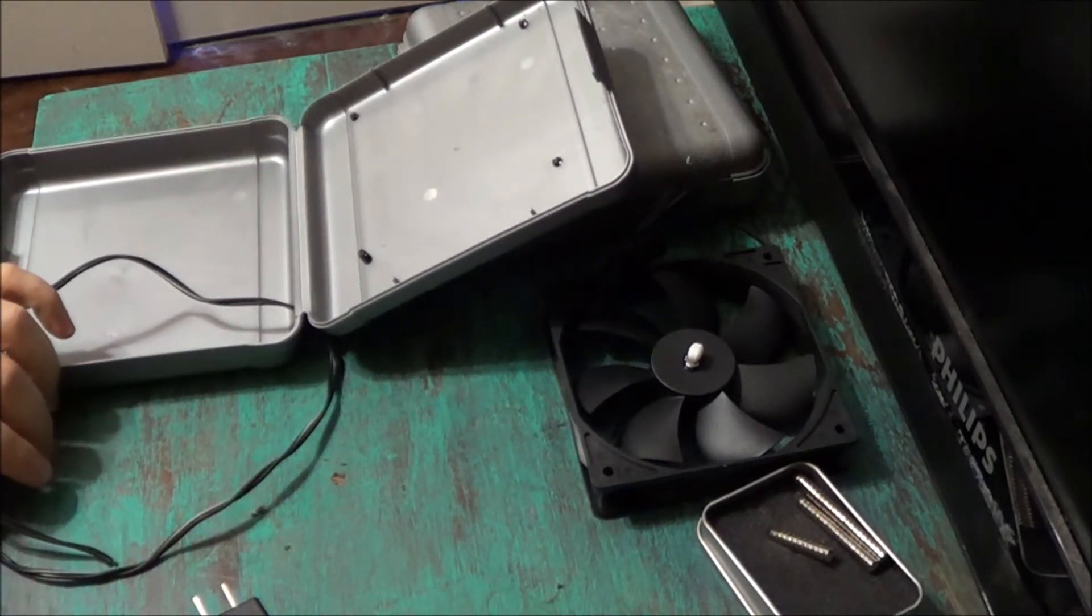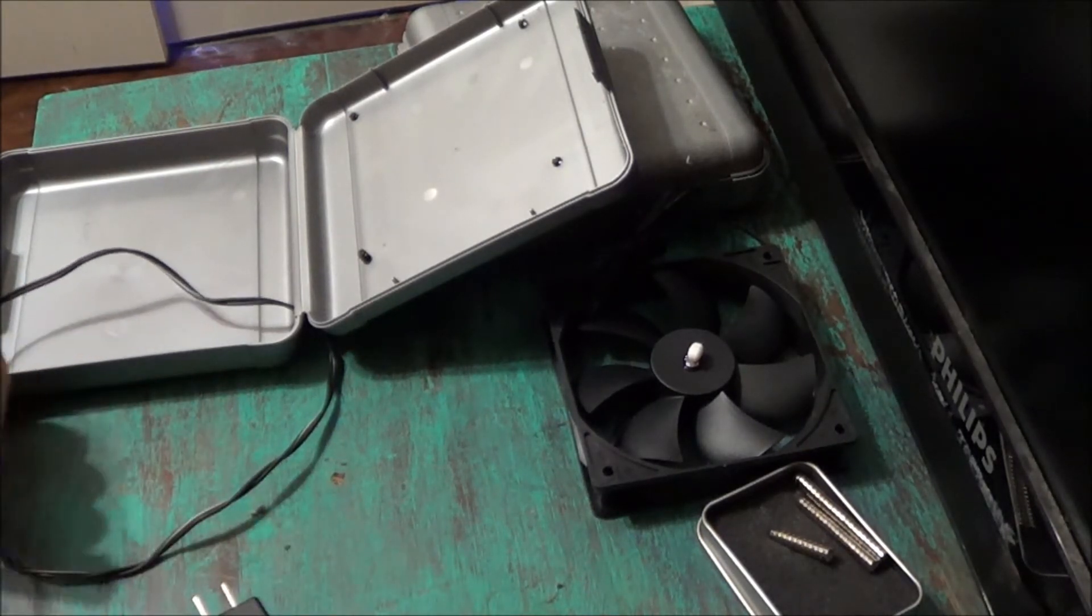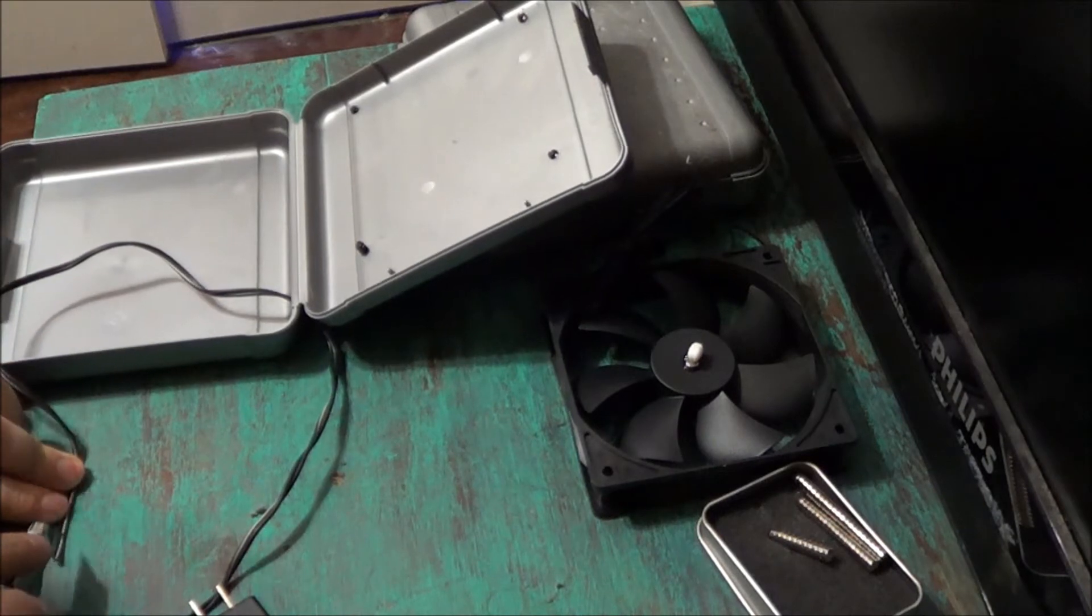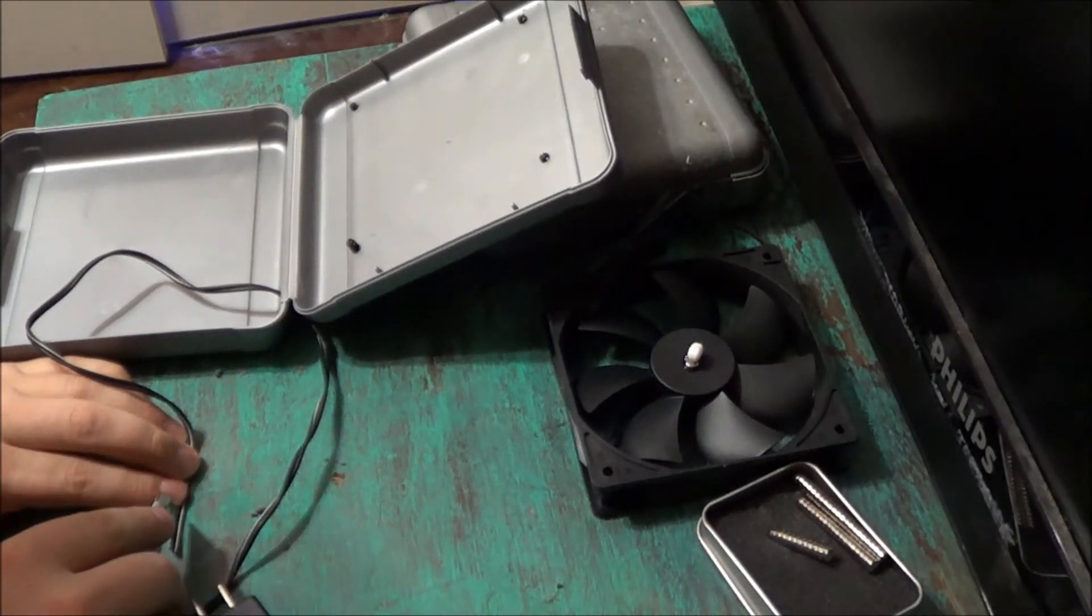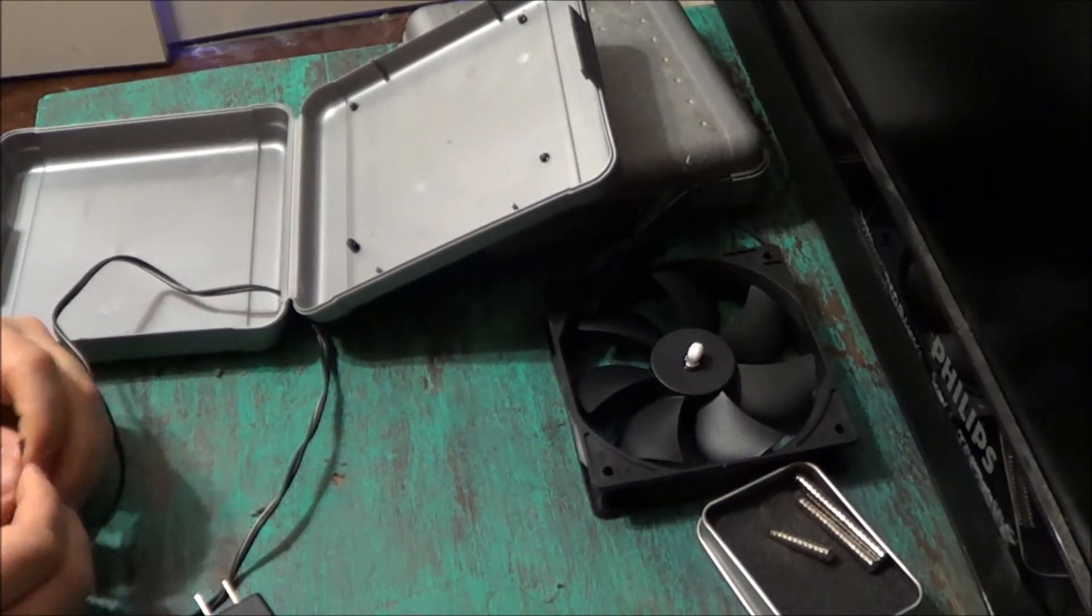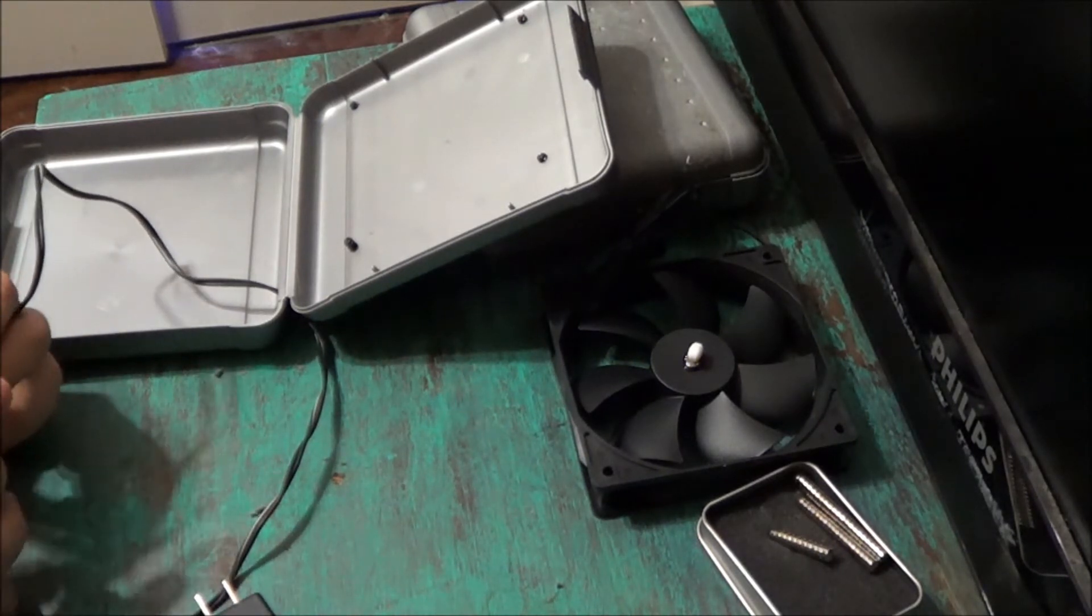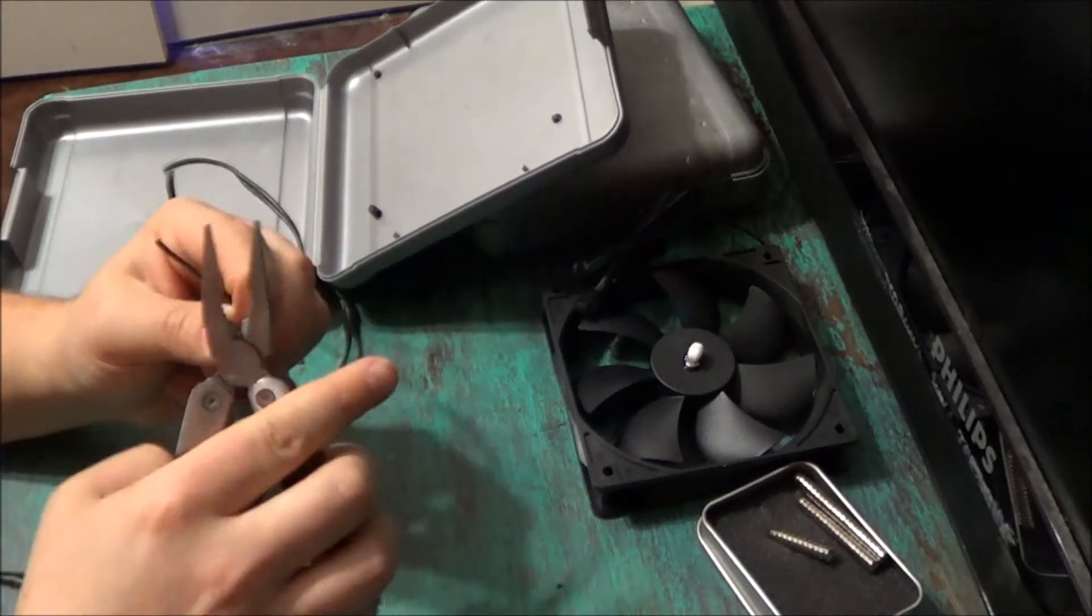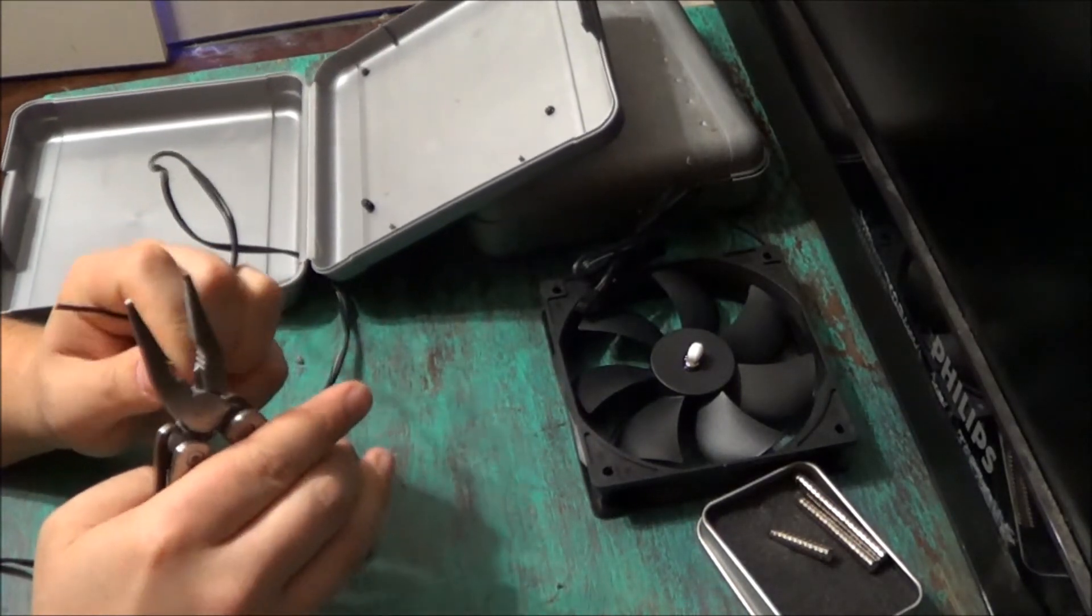Now I'm going to take my knife and I'm going to split the end of the wire down through the middle. Just be careful not to cut your fingers. Now I'm going to take my pliers and I'm going to strip the end of the plastic off of the wire.